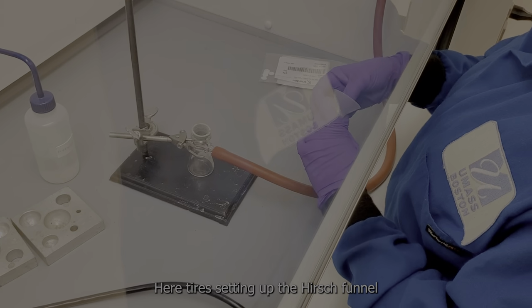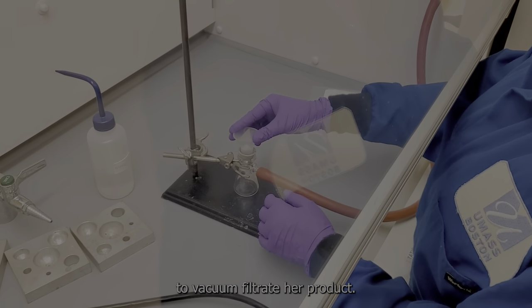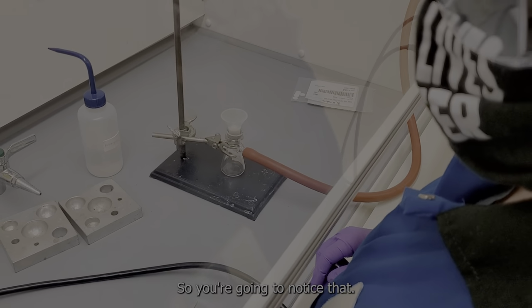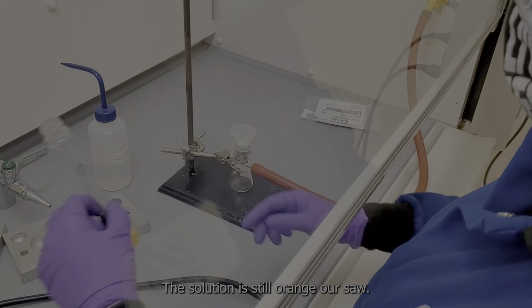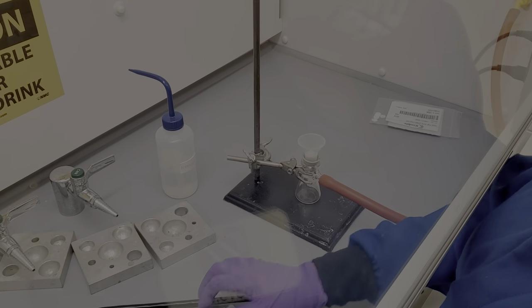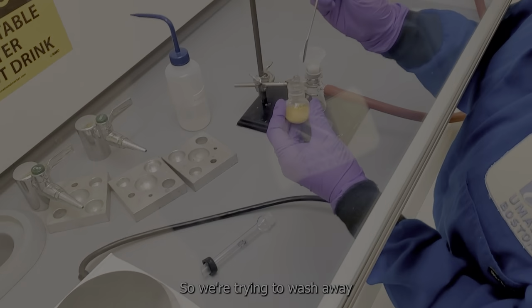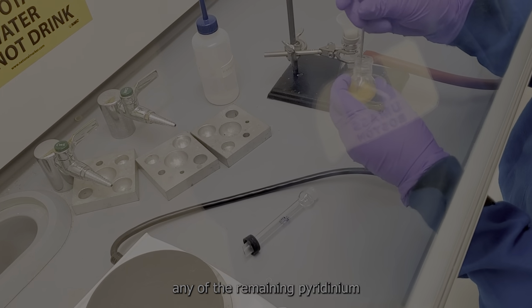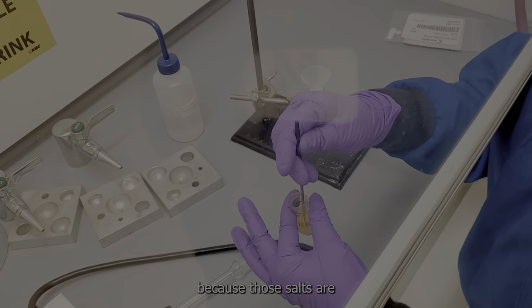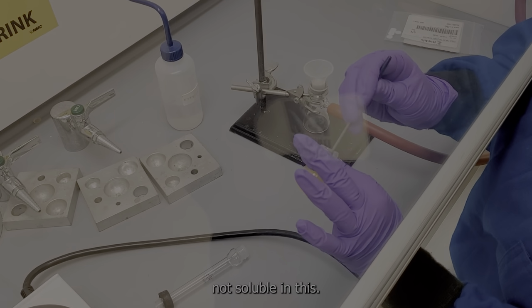Here, Tara's setting up the Hirsch funnel to vacuum filtrate her product. So, you're going to notice that the solution is still orange. Our final product is actually white. So, we're trying to wash away any of the remaining pyridinium bromide salts. So, we're using ethanol because those salts are not soluble in this.